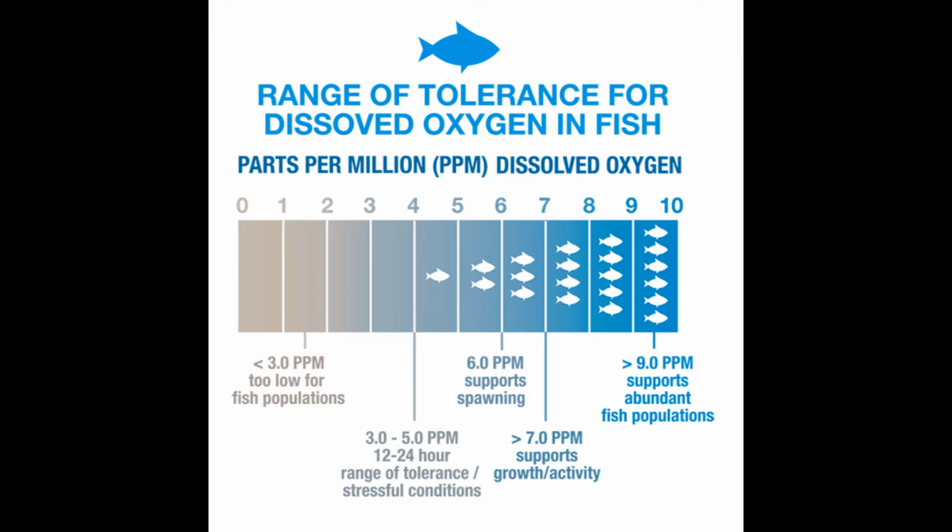The last water test in this experiment is dissolved oxygen, or DO. DO is essential for life to thrive in aquatic systems. Fish still breathe air, but they don't do it through our atmosphere. They do it through filtering the dissolved oxygen out of the water through their gills. The amount of dissolved oxygen in water is dependent on two main factors: temperature and water flow.